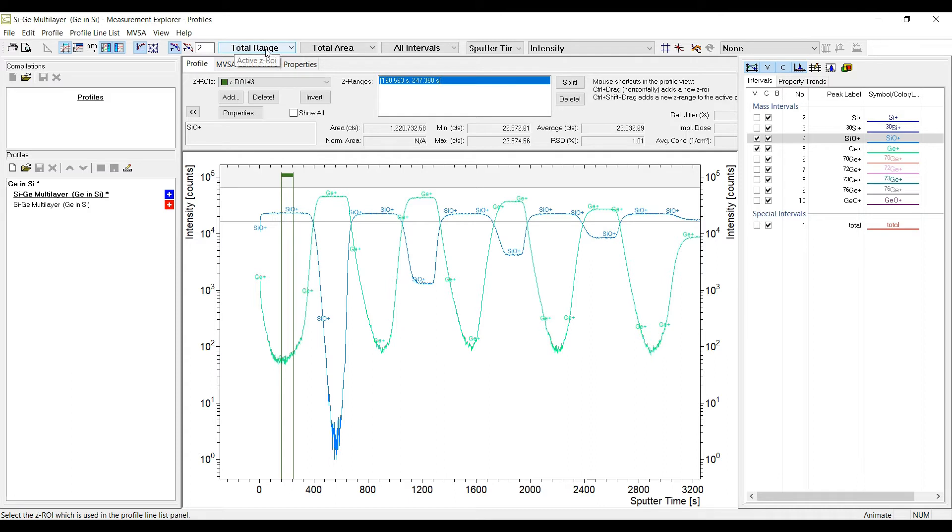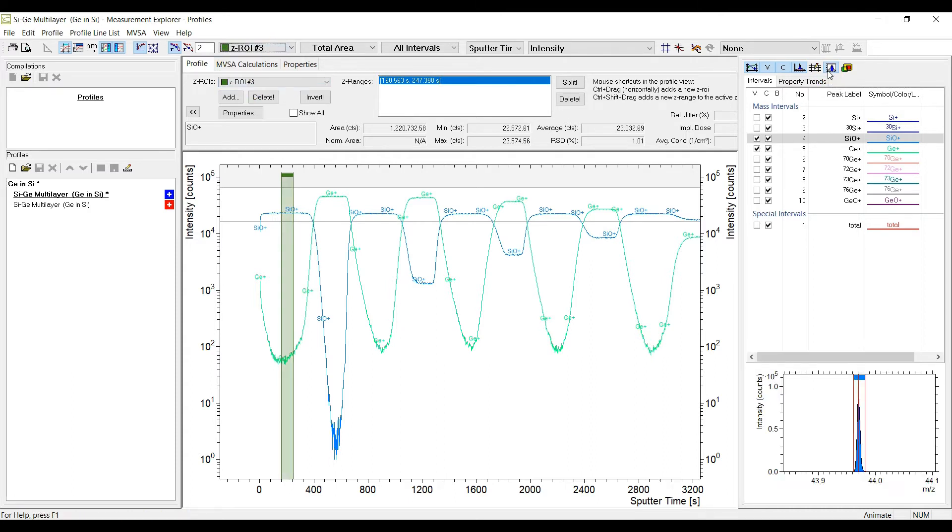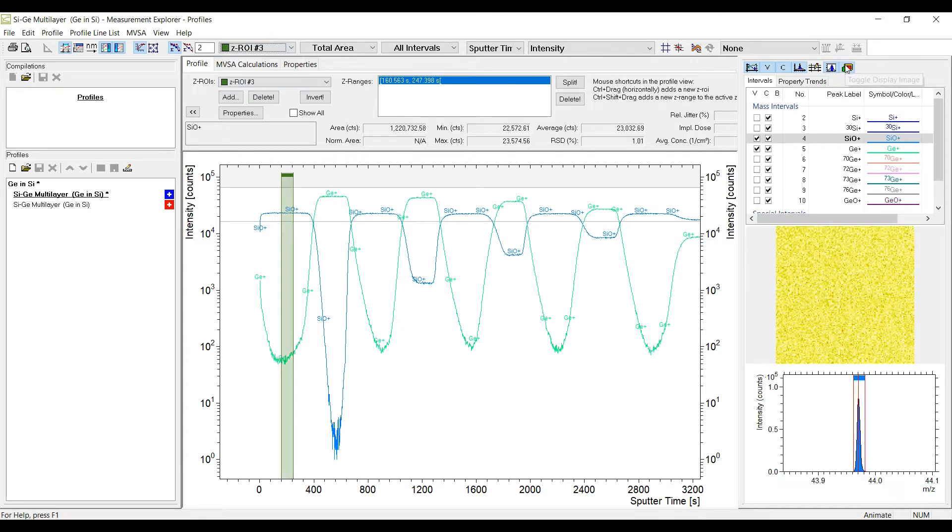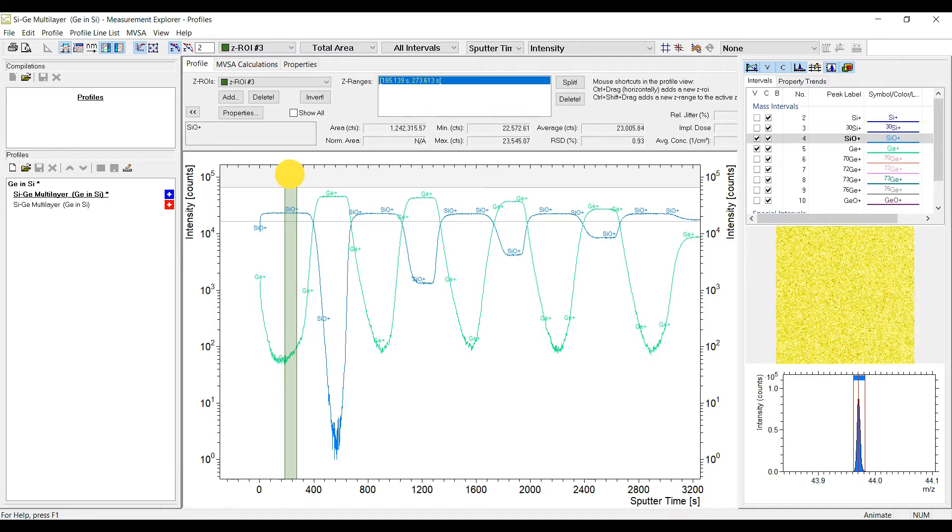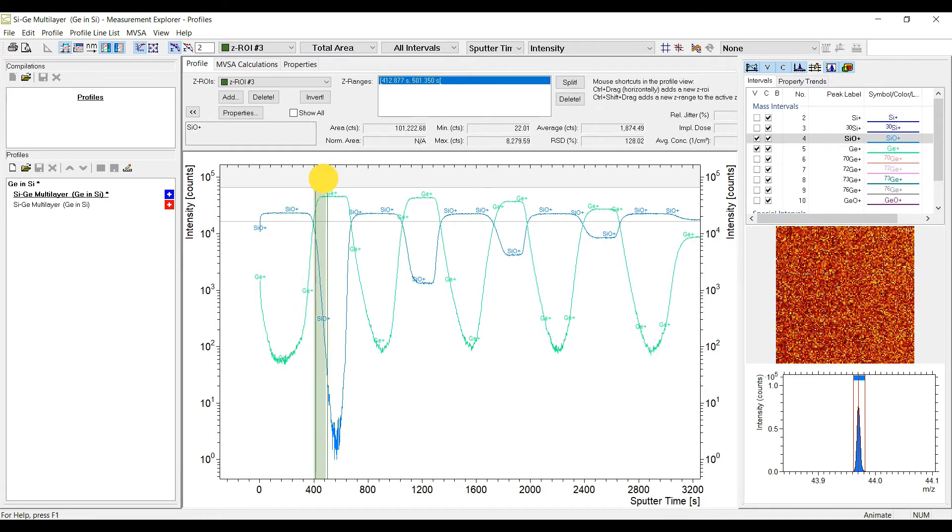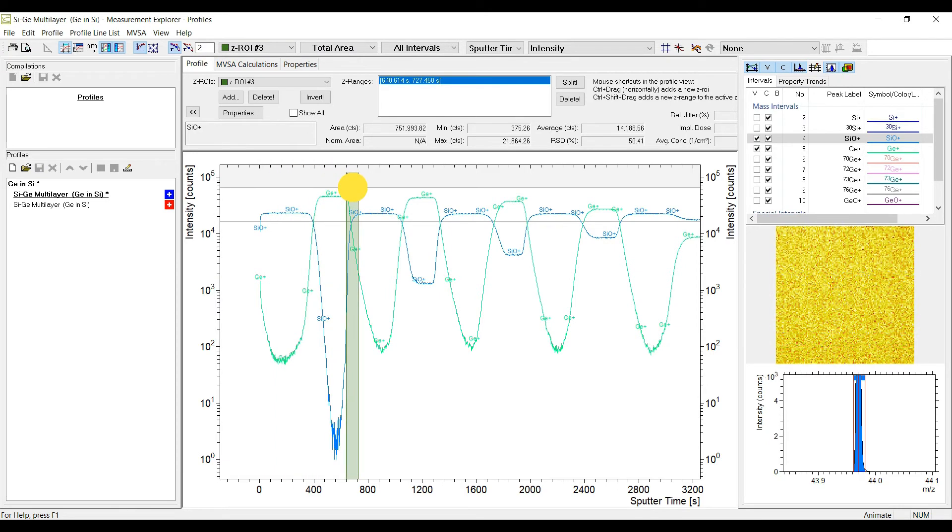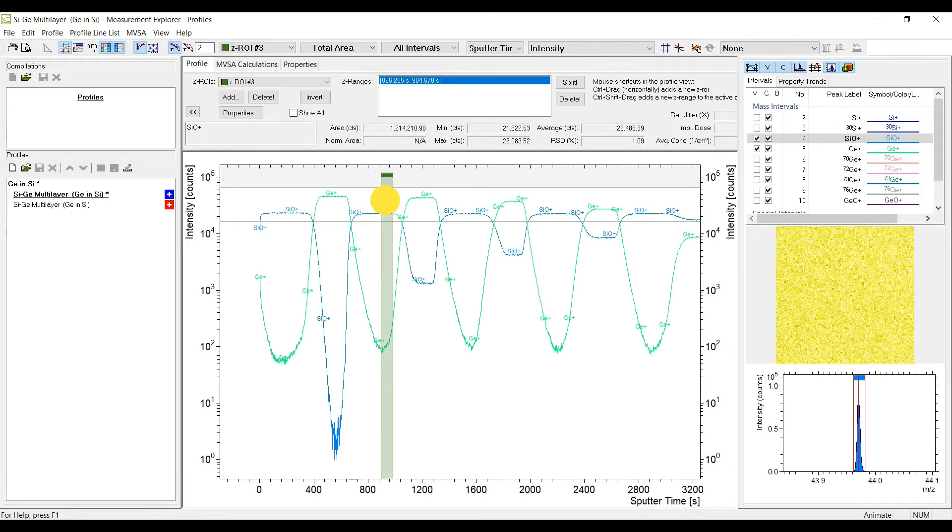You can limit the preview of a mass interval to a zero and move it across the profile while you observe the image and the spectrum preview. This allows a fast cross-check of peak properties without switching between programs.